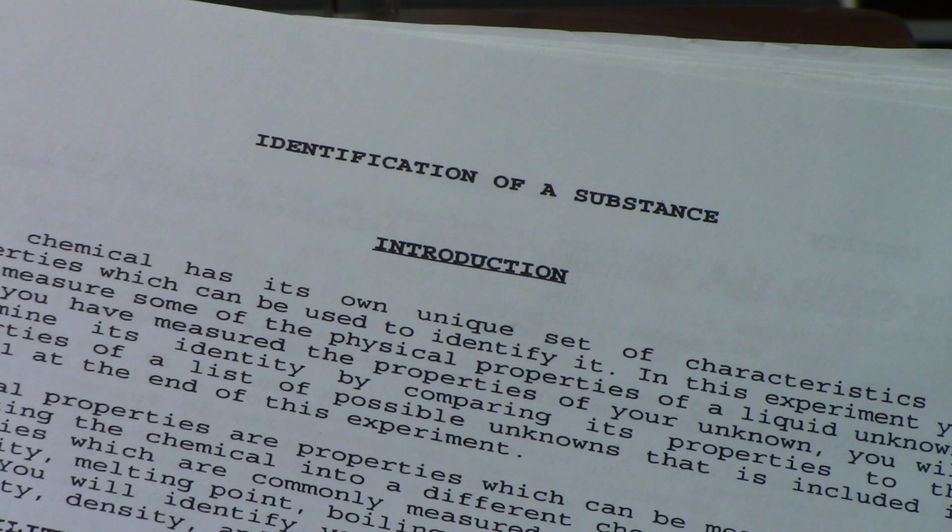So what I'm going to do is take my unknown liquid and add it to 3 known liquids. And if my unknown dissolves in the known, we call that soluble. If it does, that'll be a homogeneous mixture.